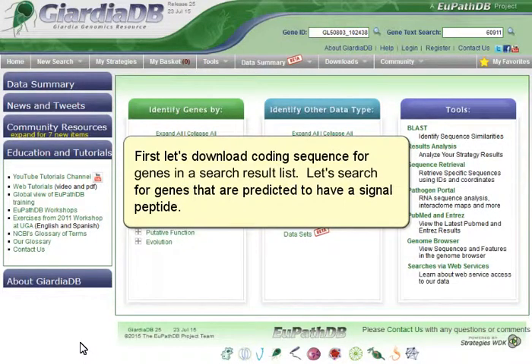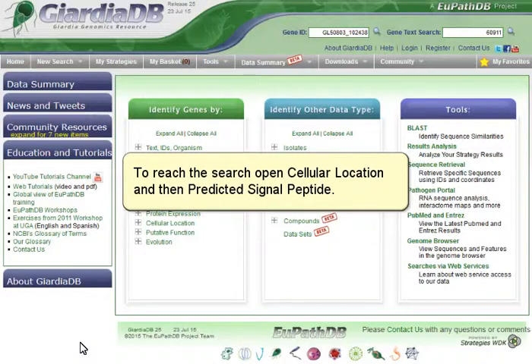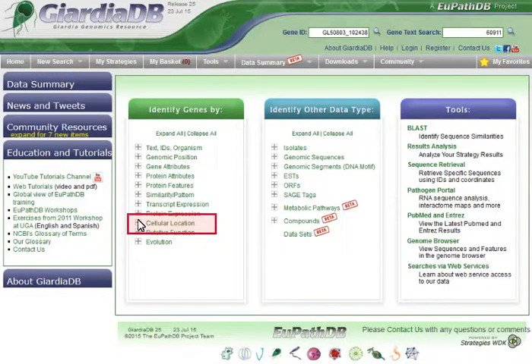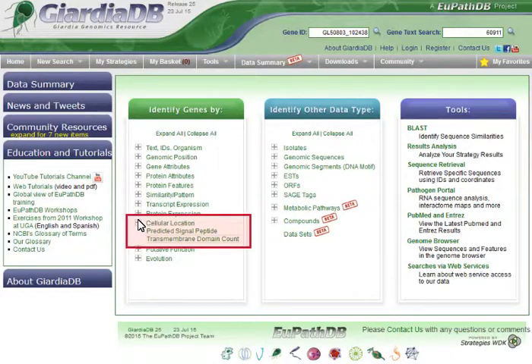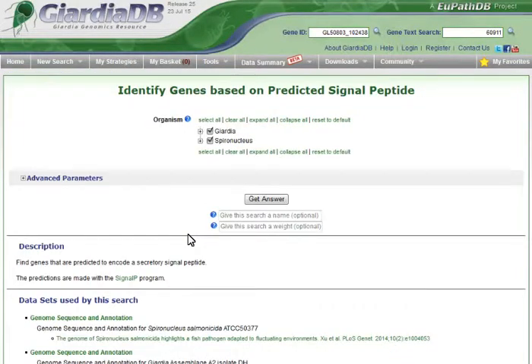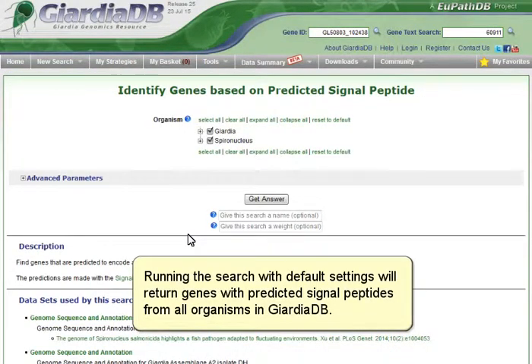First, let's download coding sequence for genes in a search result list. Let's search for genes that are predicted to have a signal peptide. To reach the search, open Cellular Location and then Predicted Signal Peptide.